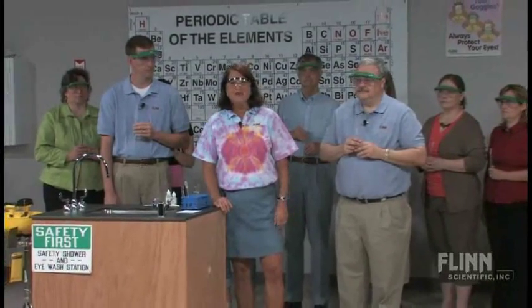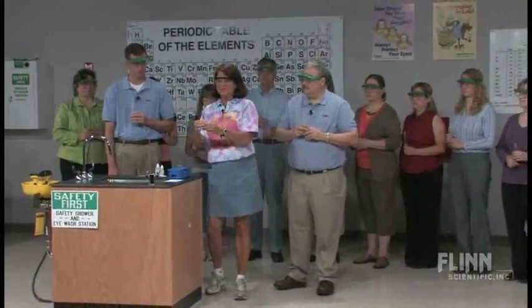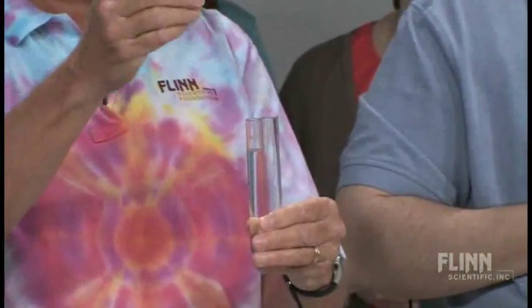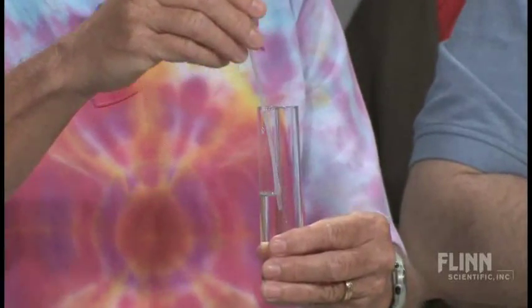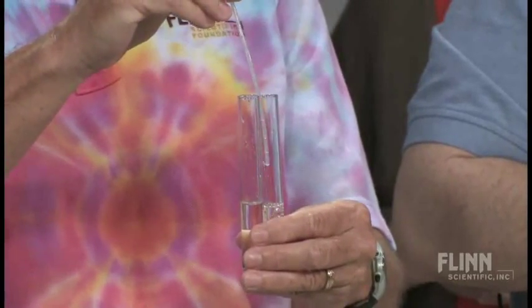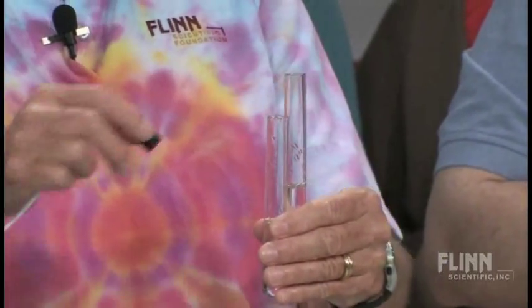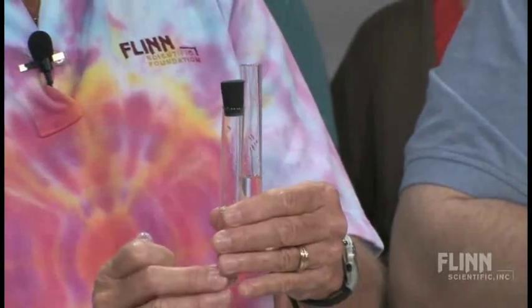So this is an activity I use, sort of a bell ringer to get my students' interest up, making them want to be on time for the second day of class. It all starts with two test tubes. In one test tube, I have a clear and colorless solution. I'm going to take this test tube and remove half of it, putting it into a second test tube. The exact amounts are not important. I'm always going to work from the upper test tube. If you're afraid you'll mix the two solutions, you might put a stopper in the lower test tube.